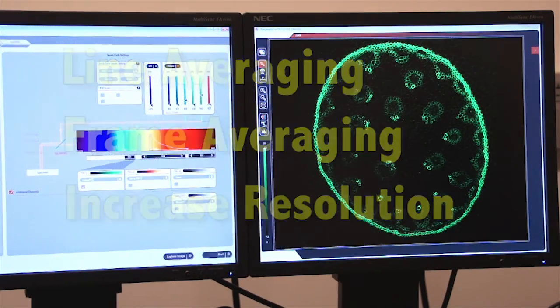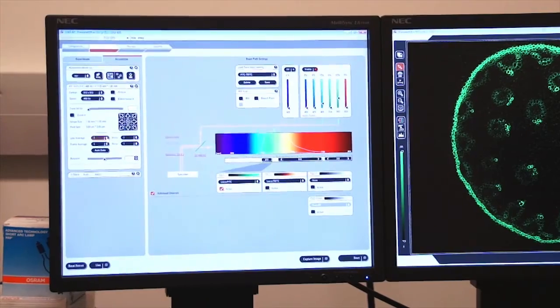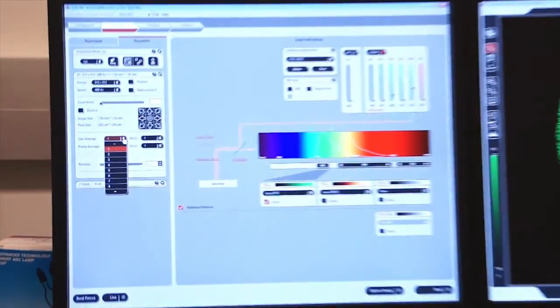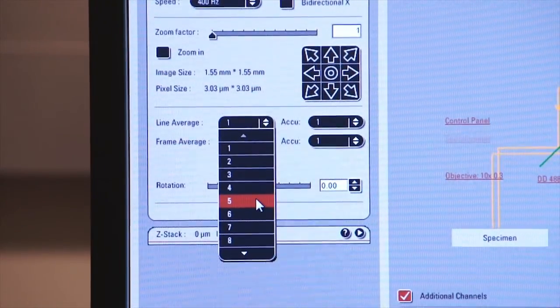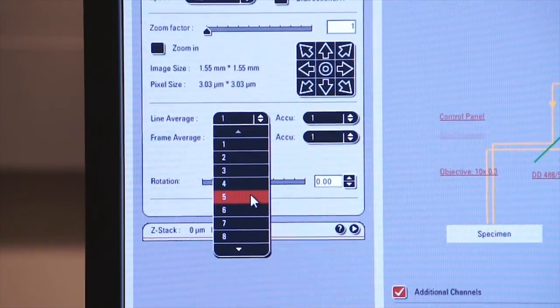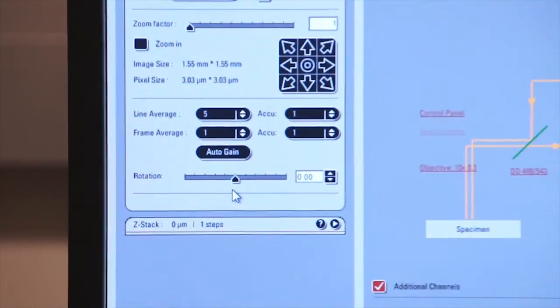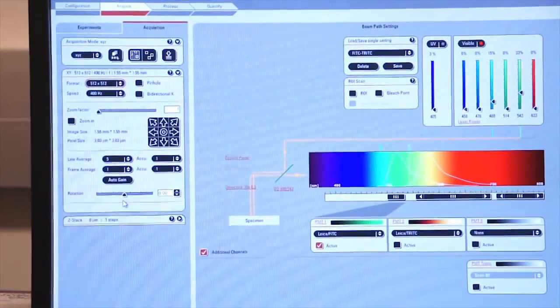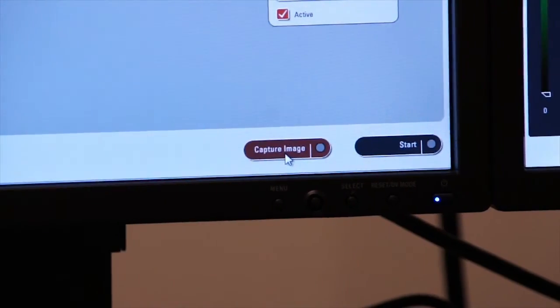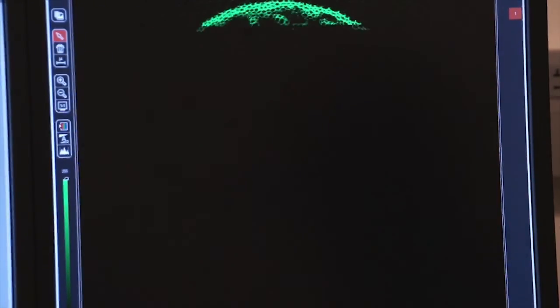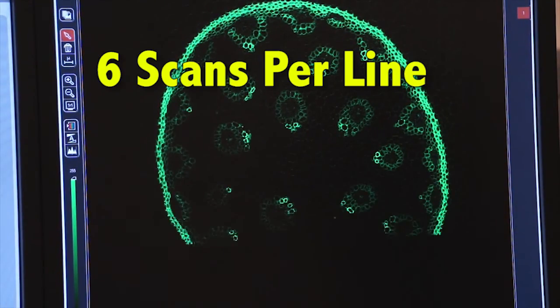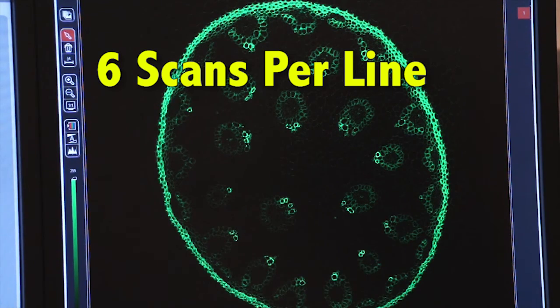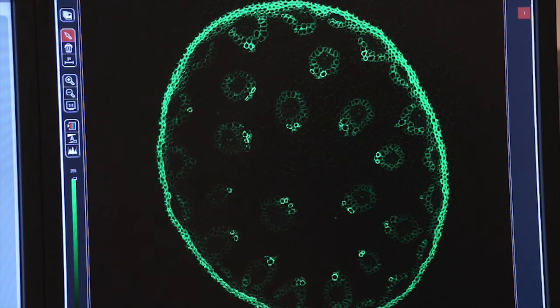So we'll click stop. And we're going to come over to the left screen. And we're going to select the pull down menu for line average. Let's do six line averages. So what are we actually doing? When I select six, I'm telling the system to read each line six times and then make a final output image. So if I click on capture image now, I'm telling the system to gather an image and it's going to take six scans per line. Now you can see that was a little slower than capturing an image with one scan per line.